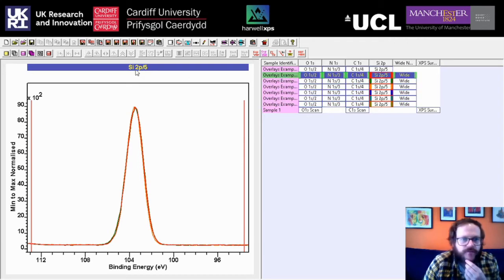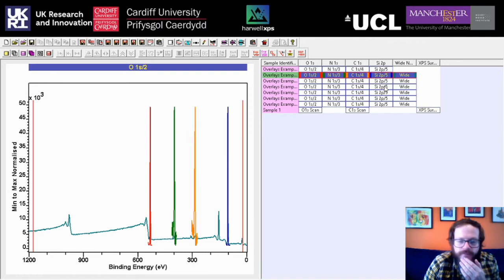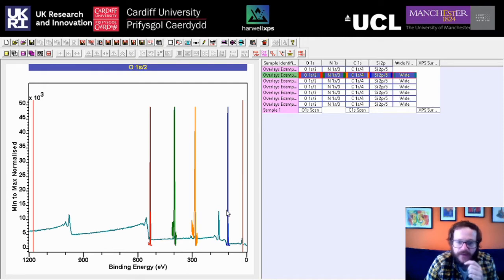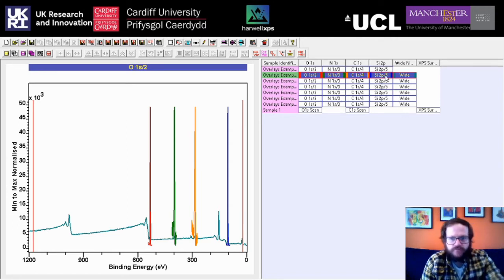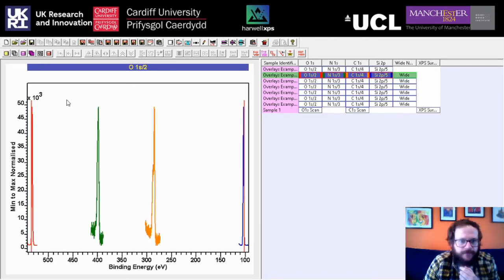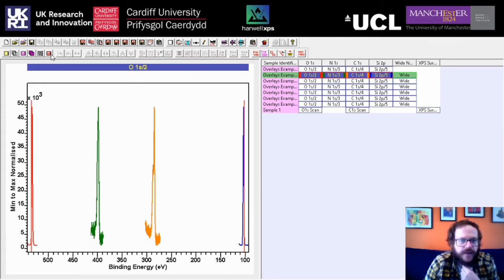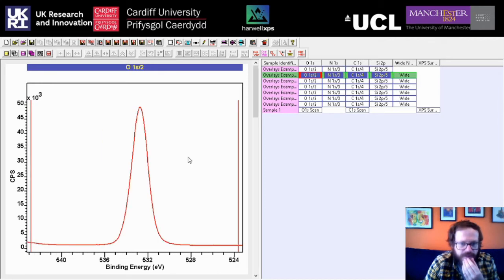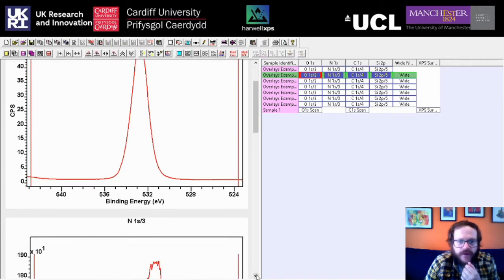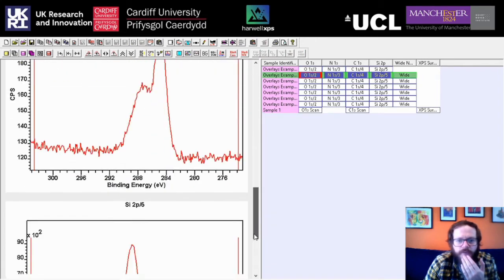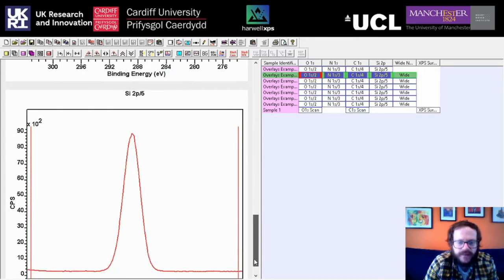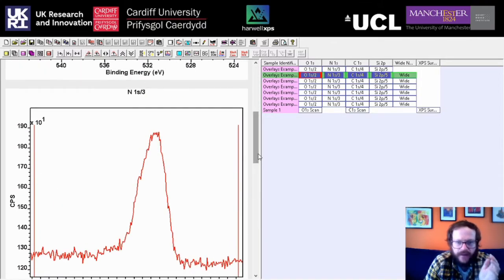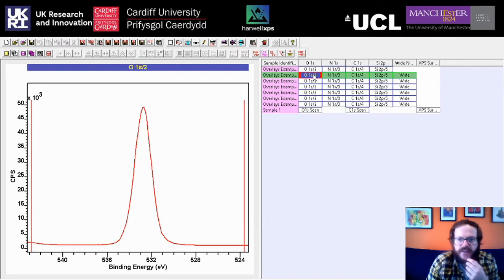If we overlay all of the elements from a single sample, we can see the wide scan along with the different colors of the different elements for the high-resolution scans. If we remove the wide scan and overlay again, there's another option called Tile by Row. Click on that and then click Order by Energy, and we can have all of our spectra from a single sample in one easy-to-manage column that we can scroll up and down — saving us from having to individually open blocks.